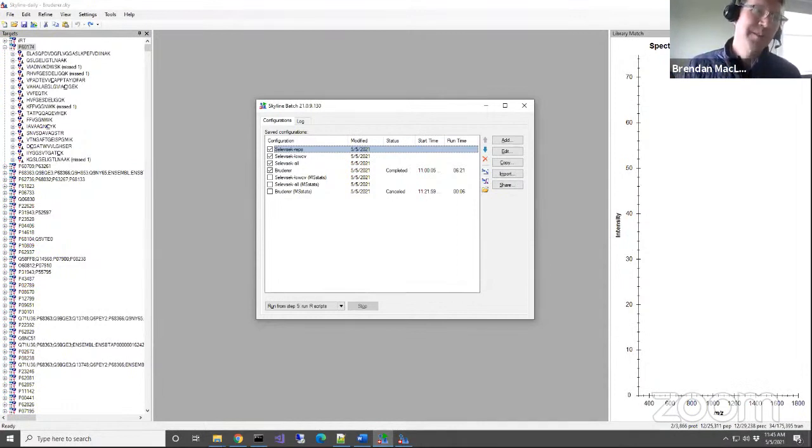There's not strictly a maximum. It's going to be based on the amount of memory you have. Again, it's really going to be relative to the number of files and the number of targets and transitions. We have people who've claimed they're doing over 1,000 files in a single document with a targeted set. So it doesn't matter how big the data is. If you target like 1,000 things, then you can probably handle all 1,000 files.